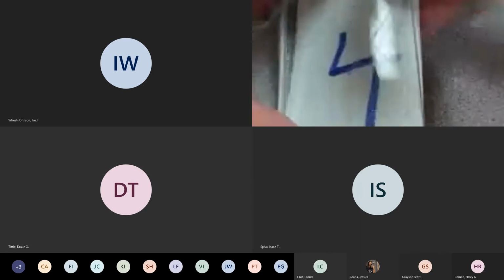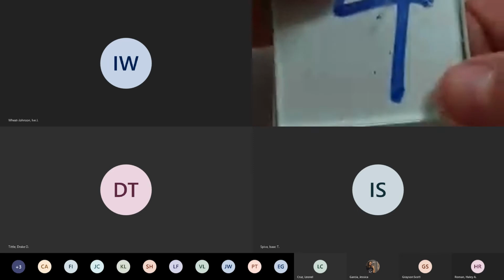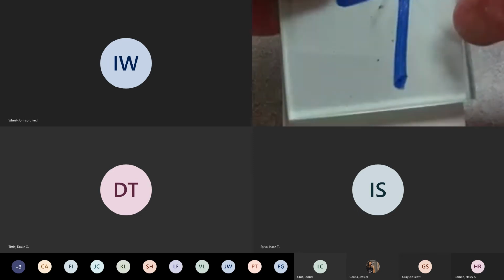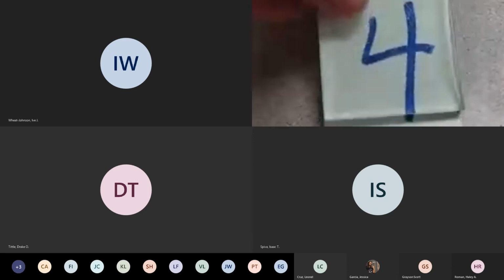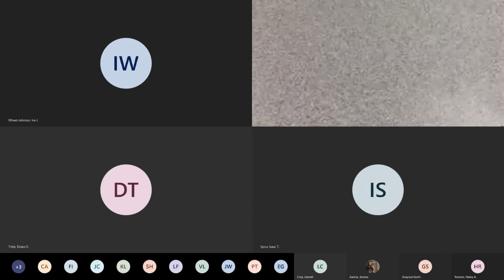It looks like now instead of one line, we now have an X. So we did have that from sample number 3, and now we have that from number 4. Clearly a rut carved into that. So give me the hardness range for sample 4.